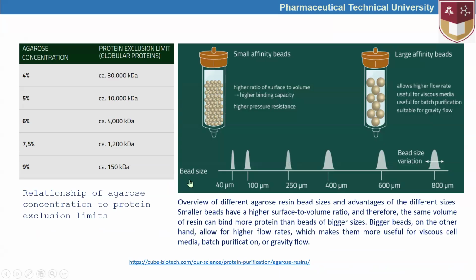And here we can see the linkage between the agarose concentration and protein exclusion limits: the higher the concentration, the lower the kilodalton limit indicated here.